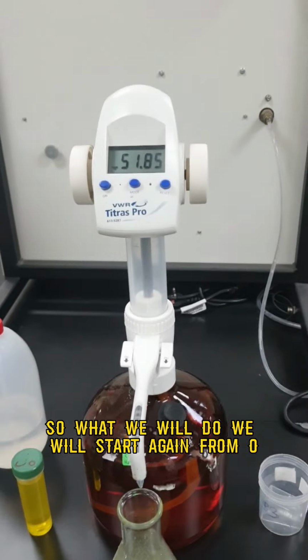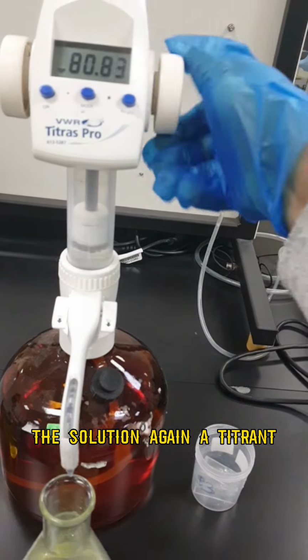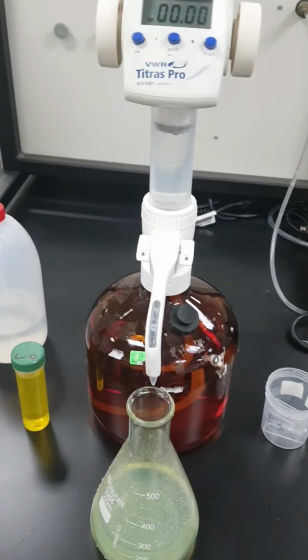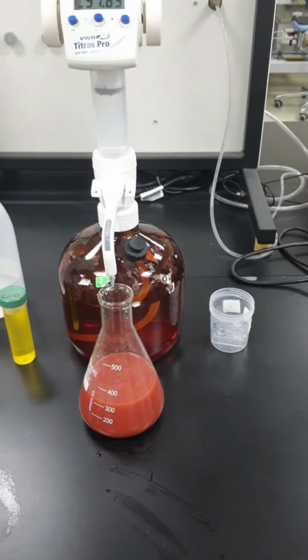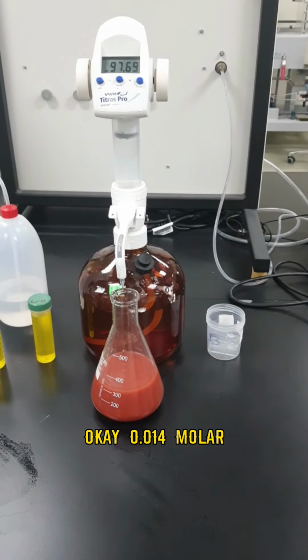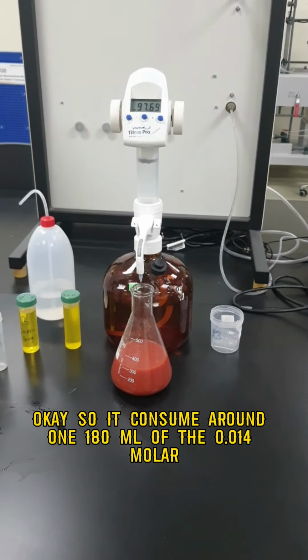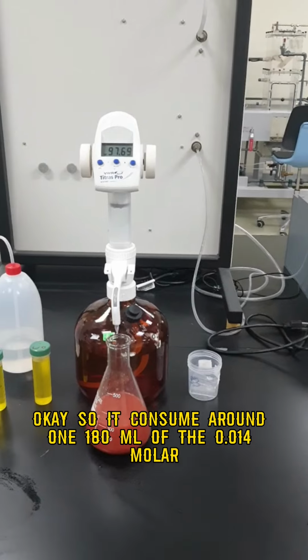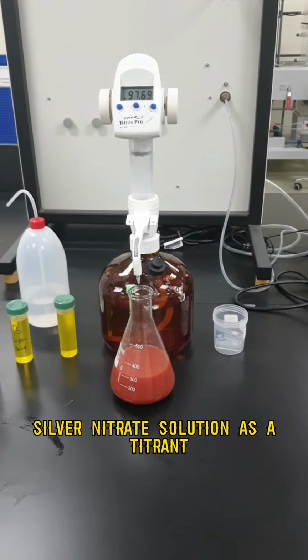So what we will do, we will start again from 0. We will reset, and then fill up the titrant solution again. So we reset, and then we will add again. You can see the endpoint, it consumes a lot of silver nitrate solution, 0.014. So this is our endpoint. It consumes around 180 ml of the 0.014 molar silver nitrate solution as a titrant.